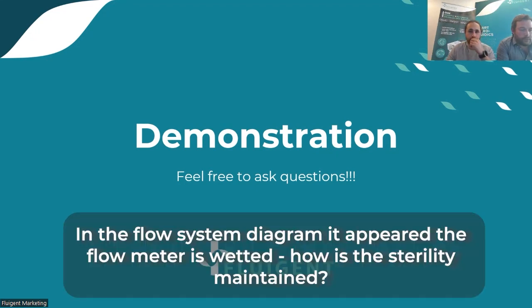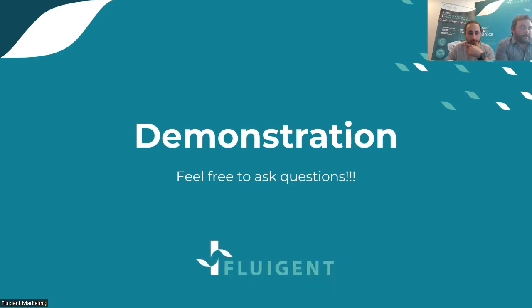So there is one question on the sterility of the flow sensor. Yes, in the system, there is a flow sensor inside the machine, so you cannot remove it, indeed. The sterility is ensured through 2 steps. When you start an experiment, you will see in the app that in the protocol, you have a specific step called sterilization, where you are asked to put cleaning solutions in the reservoir in a given order.